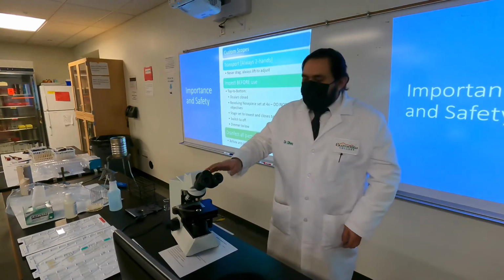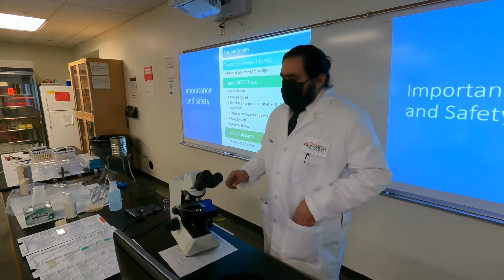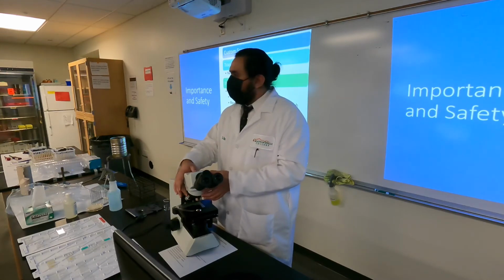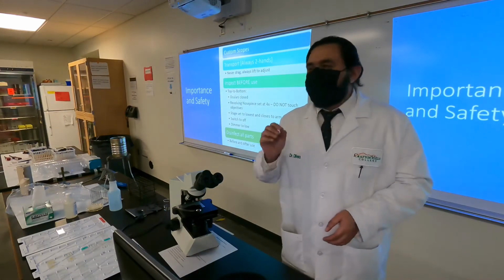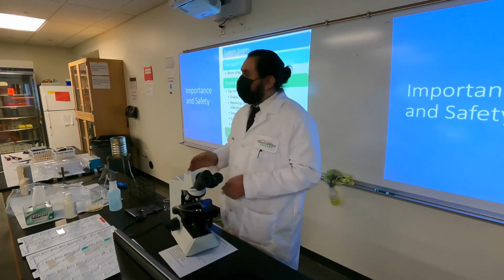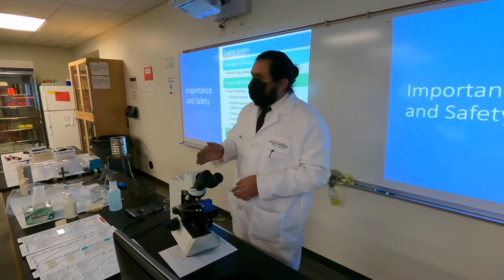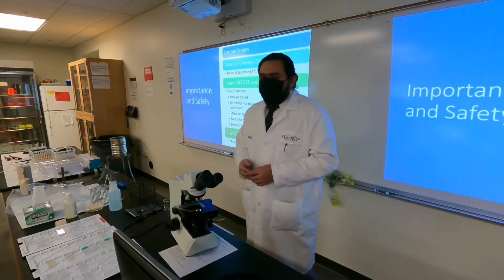Then you're gonna proceed down a little bit more to where the little rubberized revolving nose piece is, the thing that looks like a little black ridge, right? And that's the way you move your objectives, never touching the objectives themselves. You touch the objectives, you're gonna break them. So only use that little rubberized nose piece there. And it should be at the lowest objective. It should be at the 4X, the one that has a little red band around it. It's the short and stubby one. That's the one where it should be, always. That's where you begin, that's where you end. That's where you transition for every experiment. You always go back to the red one, okay? So it should be there. Again, don't touch the objectives because they'll snap off or misadjust. And again, you owe me a new car, right?